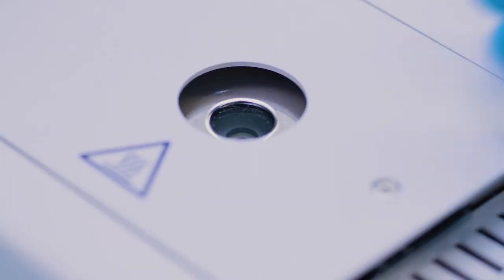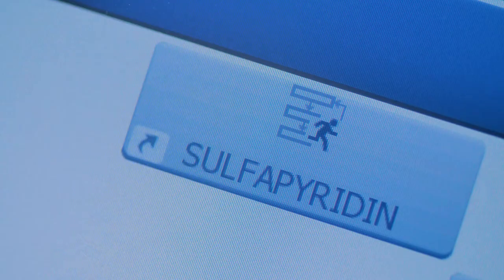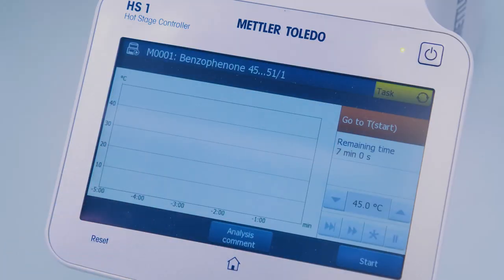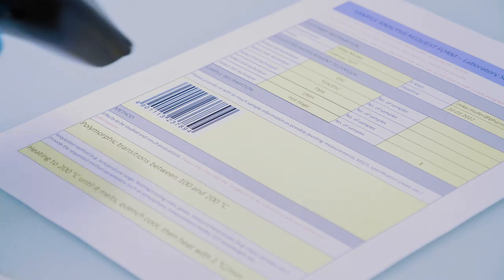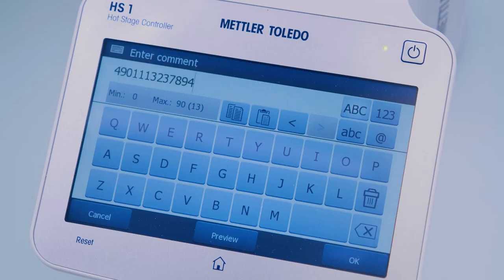With both systems you can start frequently used methods by one click. Simple and efficient. Sample identification with a barcode accelerates your workflow even further.